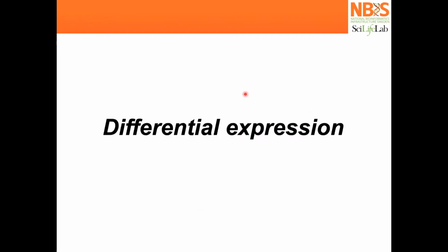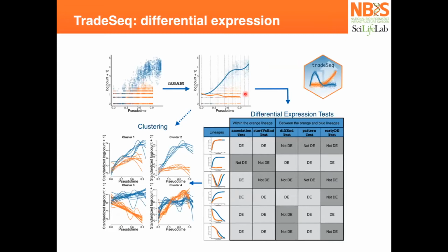But now that you have these different cell stages, or this path that you delineated using the pseudotime, the final step is to find genes that are differentiated in the middle of this process. And for that, one of the packages, for example, in R, is TradeSeq. For PAGA, they also have a test that is kind of similar to this as well. So I'll just refer to this one, but the idea is quite similar.